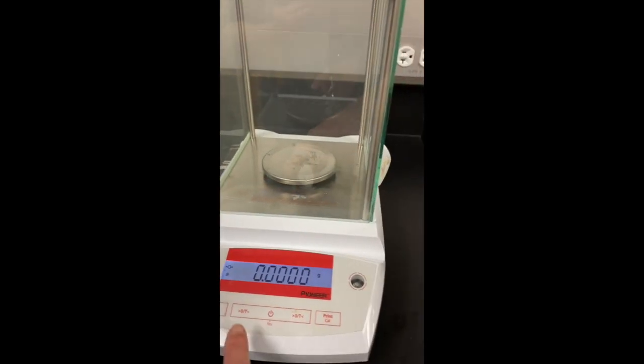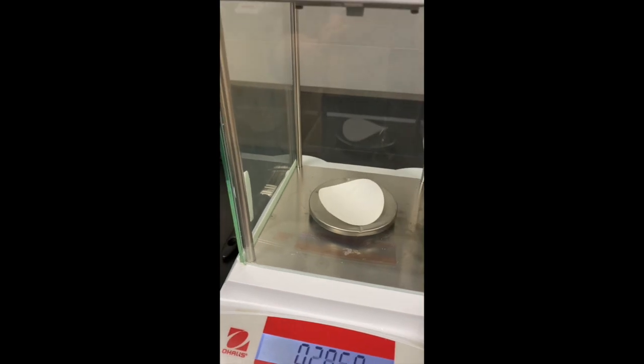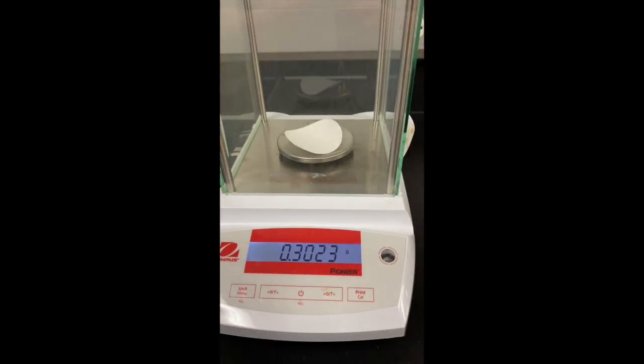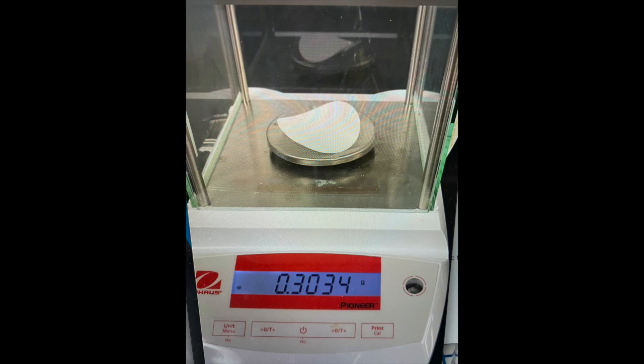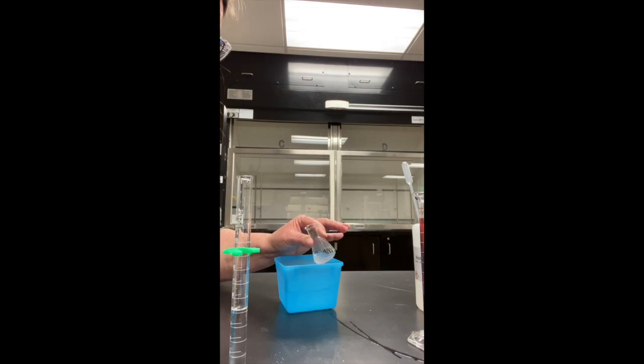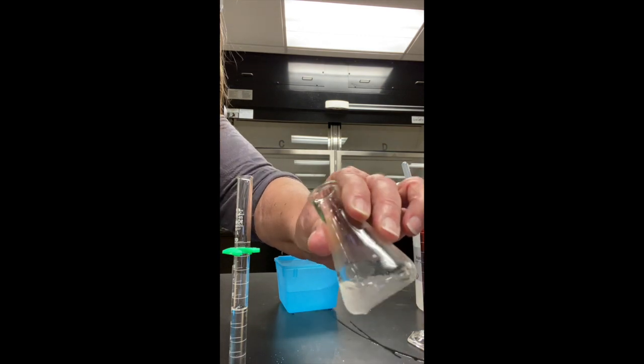So we're going to go ahead and make sure that our balance is tared and on our paper. And we're going to record the mass. So I had this in an ice bath for about five to seven minutes and it actually made some crystals. I guess that was pretty cold.